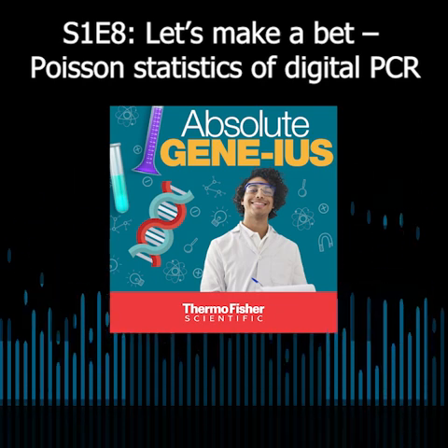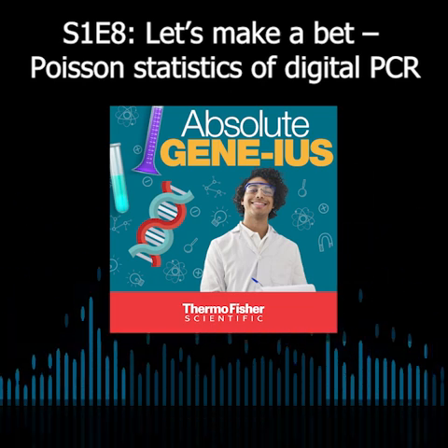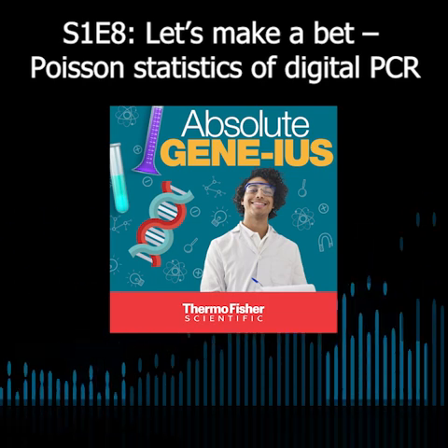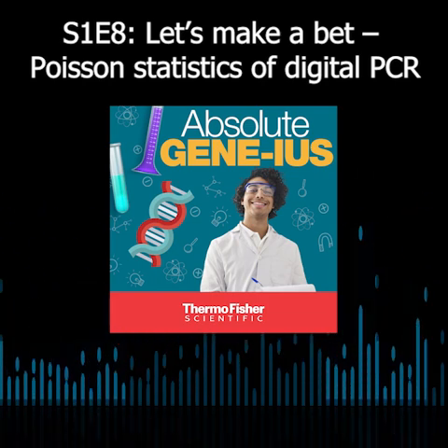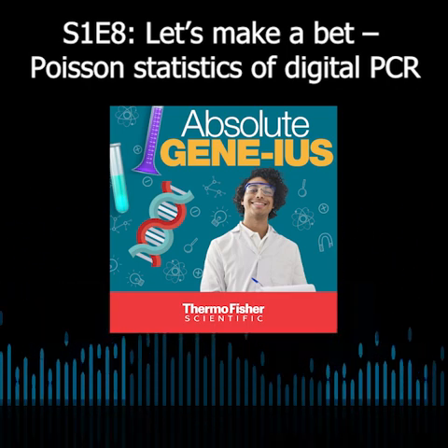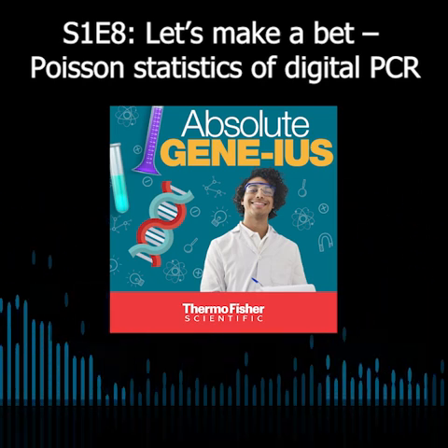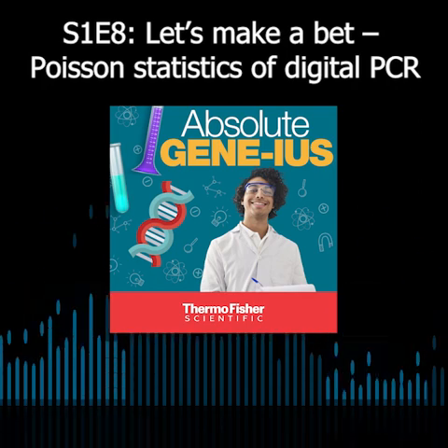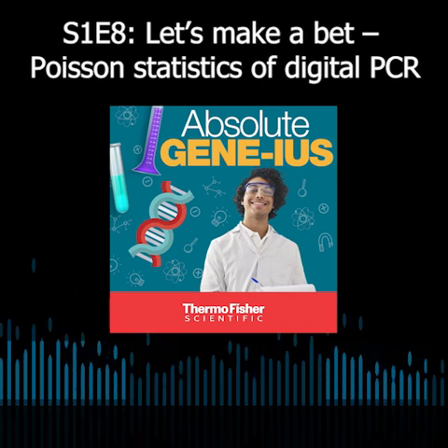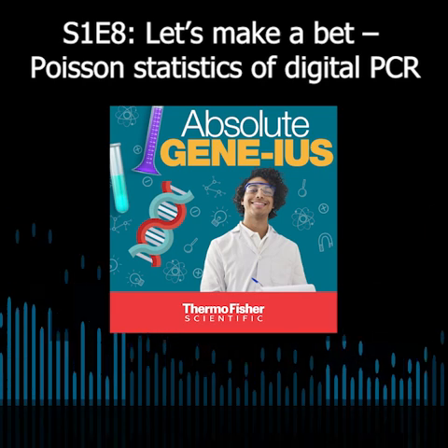Talking about those micro reactions and those microchambers, what does the result look like for digital PCR? So with the analysis of the data, really is that yes, no, thousands and thousands of times. But that's not really what we want in the end. We want something informative to our experiment. And usually that's going to be a concentration. How many copies per microliter? So there's some extra math under the hood in the software for any digital PCR system that lets us convert that string of yeses and nos into a concentration, a copies of your DNA target per microliter.